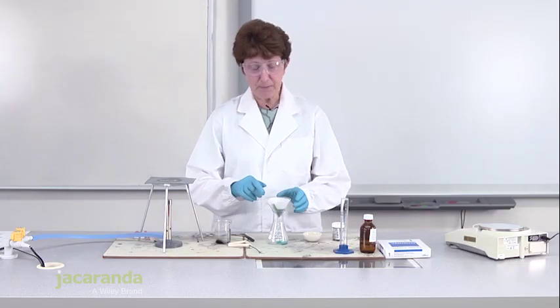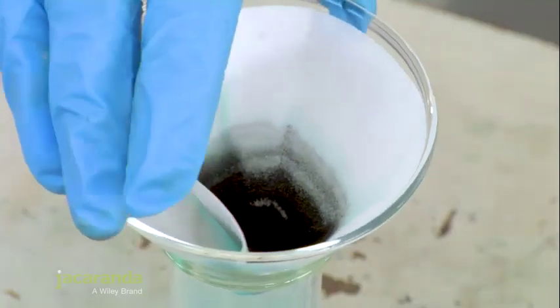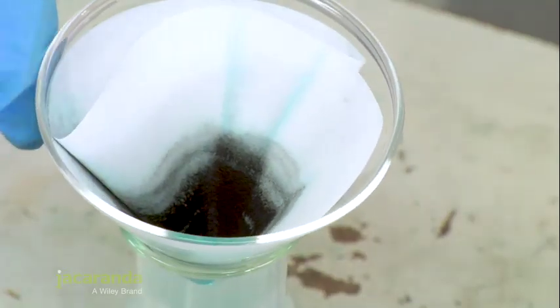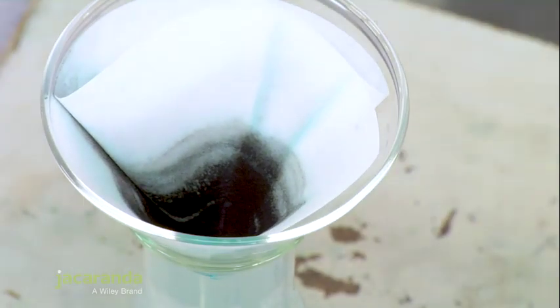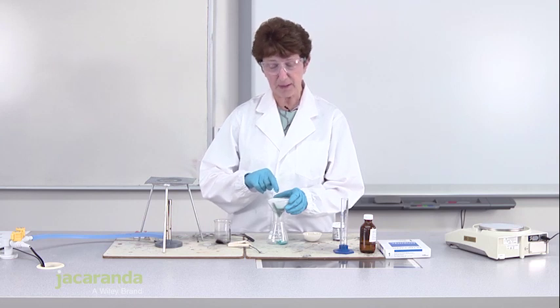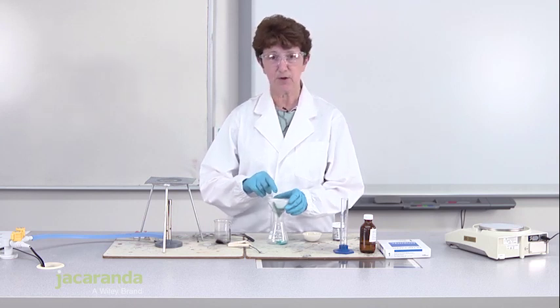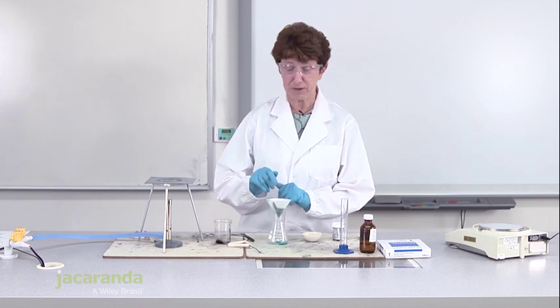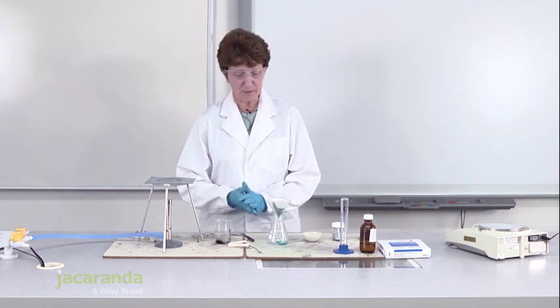Left in the filter paper is black copper oxide and you can see that's going to stay in the filter paper because it's insoluble. That black copper oxide is the excess copper oxide and it's called the residue. So we're just going to filter that.